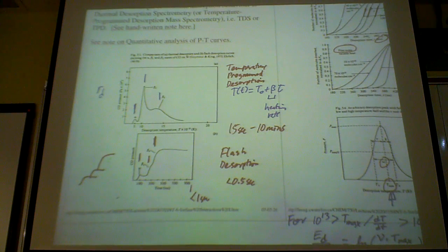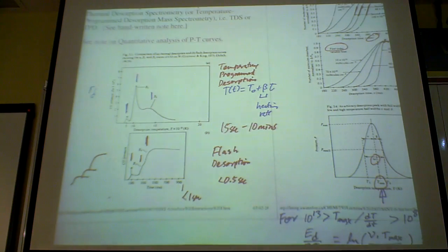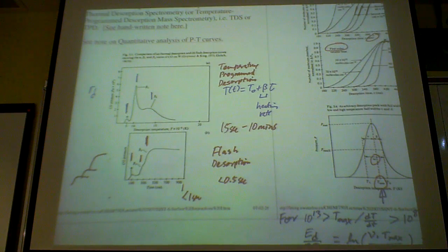And the advantage of using not just a pressure gauge but a mass spec is that you can measure individual components of your gas. So it could be CO or N2, depending on what you adsorb on the surface. You can really do a lot of analytical chemistry, what desorbed that comes off from your surface, by looking at the mass spectrum of the gas that comes off.